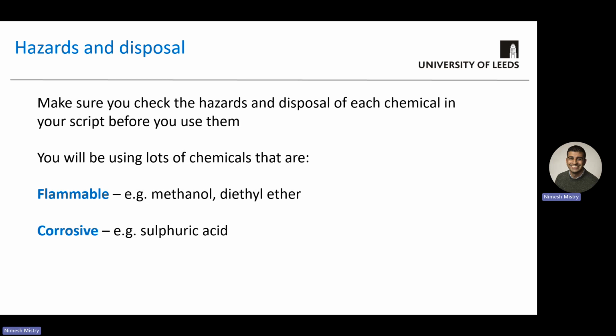Also, you're going to be using sulfuric acid, and you're going to be using concentrated sulfuric acid. This is very, very corrosive, and you really have to make sure that you're using gloves, and you've got to make sure that you are mopping up any spills and diluting it down with water as well. Concentrated sulfuric acid is a lot more corrosive than dilute sulfuric acid, so do make sure you are handling this safely. You only need a small amount to be in contact with your skin to cause a severe burn.